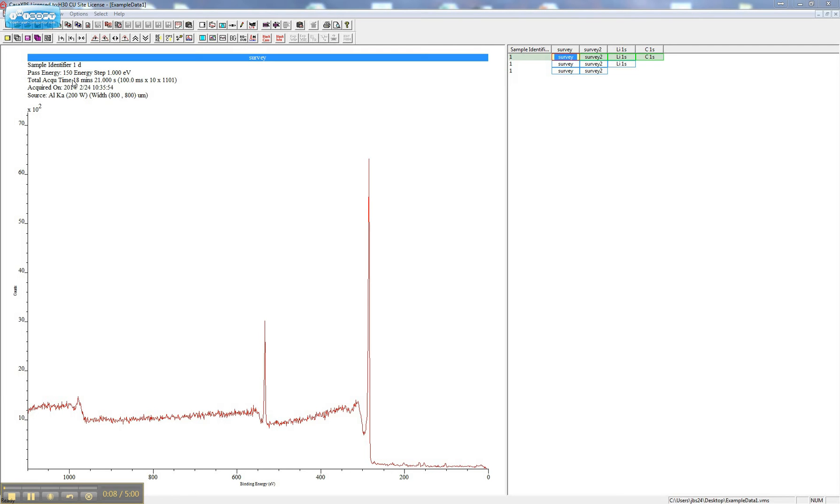This VAMAS file was opened in CASA, and data were obtained using a Surface Science Instruments XPS system. Survey scans were collected using 150V pass energy, the only pass energy for which the SSI system is calibrated.